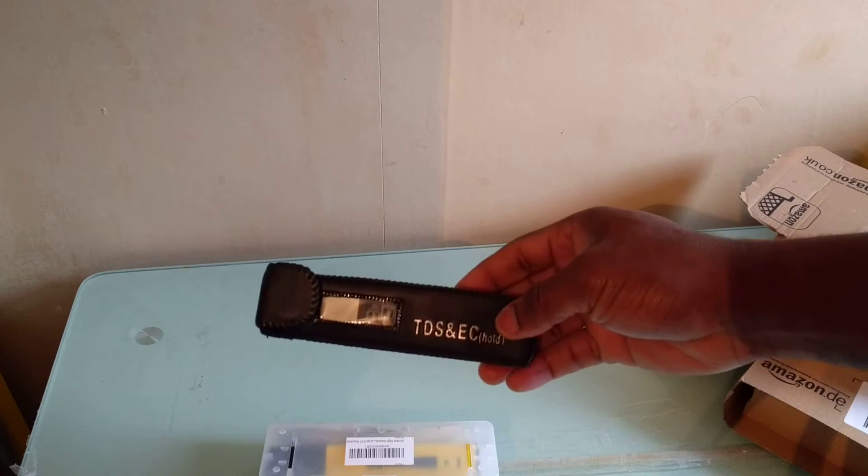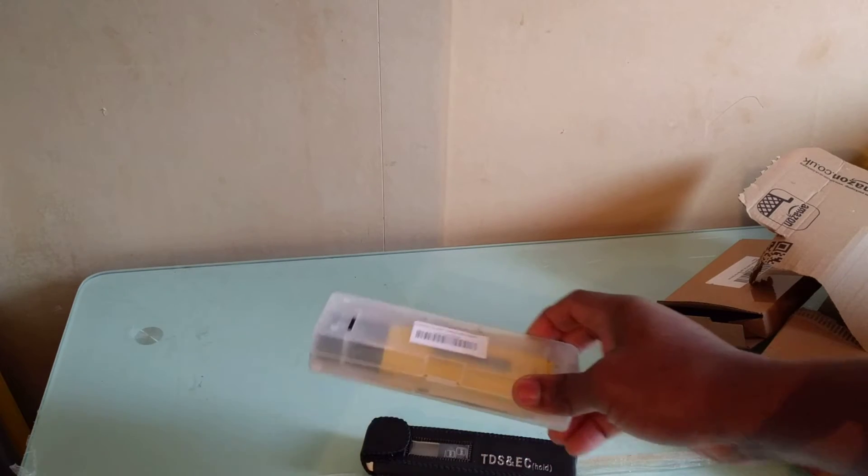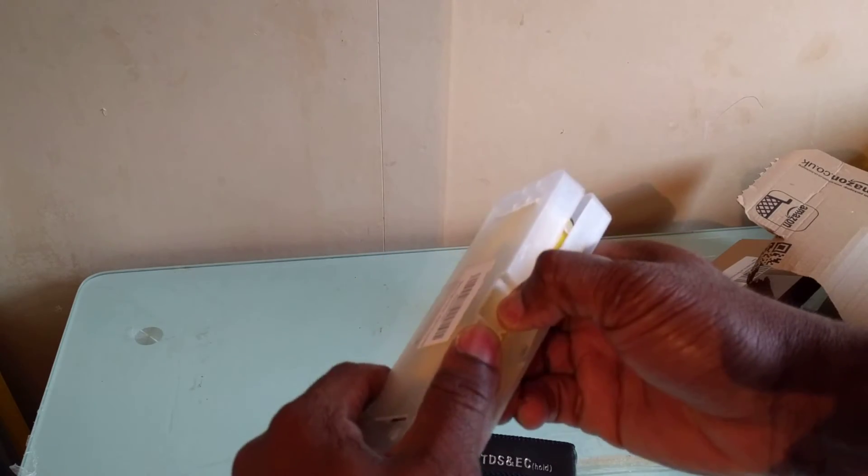What's up YouTube, this is Sir Burks coming to you live and direct. Today we have got two products to review, but before we do that let us just open the parcel — coming straight from Amazon. So first we've got a pH tester to test your water, and the other one we have got a TDS and EC tester as well. Let's unbox the pH tester first.